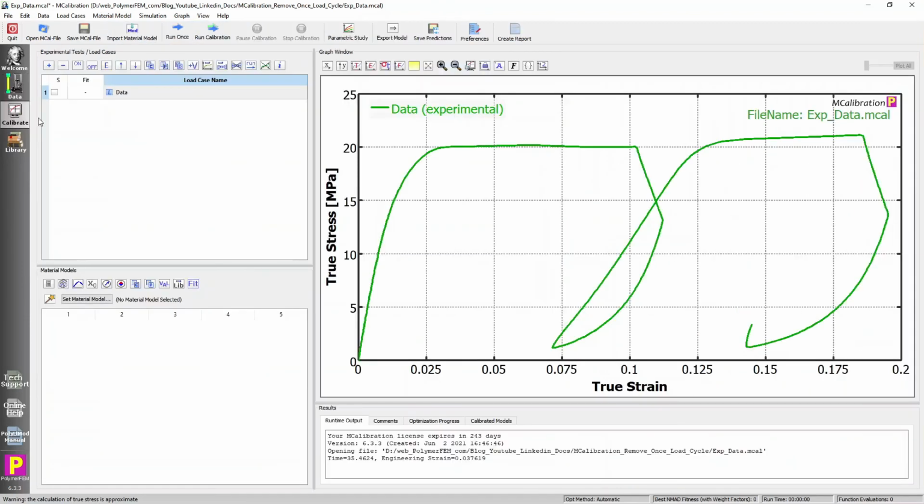I can clear this table, and here it is. I got rid of it. The strain rate is fine. Everything is okay. I only touched a little portion, and I shifted everything to the left to make it fit again.